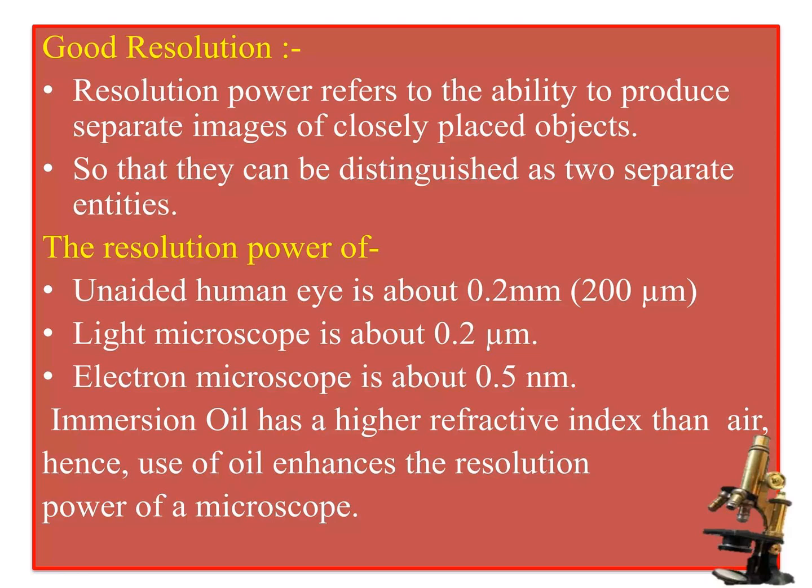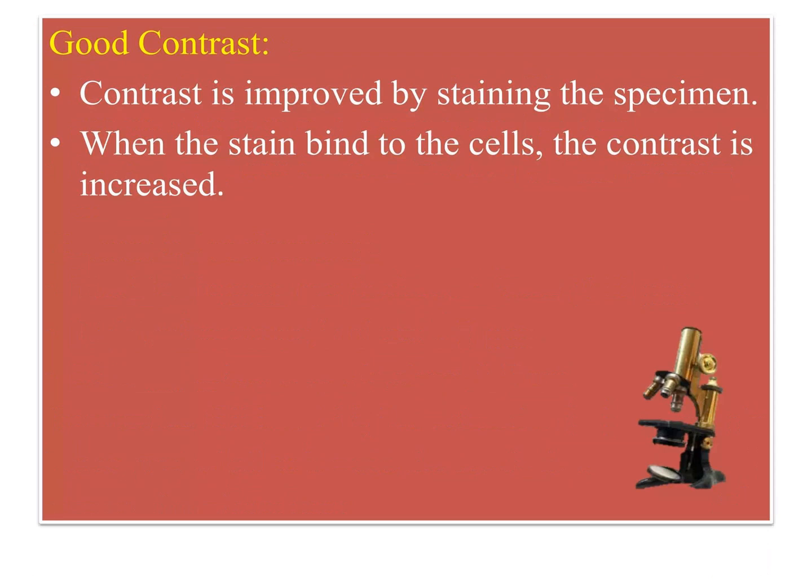The resolution power of the human eye is about 0.2 millimeter. A light microscope is about 0.2 micrometer. An electron microscope is about 0.5 nanometer. Immersion oil has a higher refractive index than air. Hence, the use of oil enhances the resolution of a microscope.